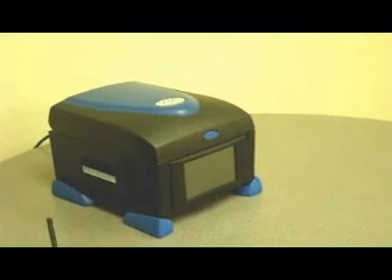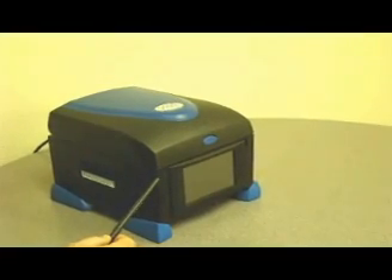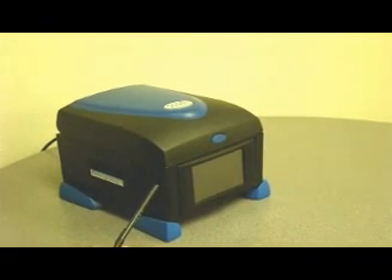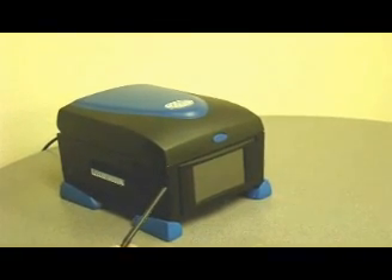Amplitronics brand thermal cyclers are available in two models: the standard A4 cycler and the advanced high-performance A6 gradient cycler.